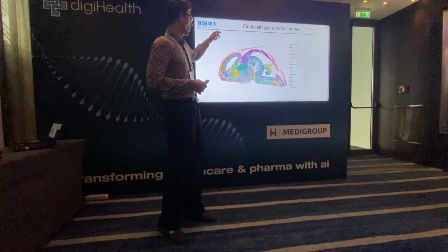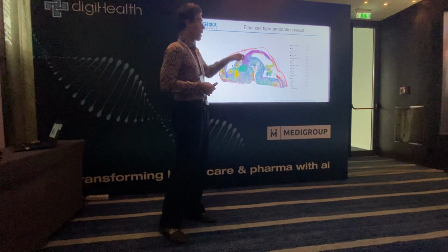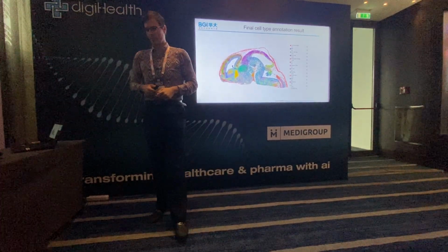So we have a data set with annotated cell types.